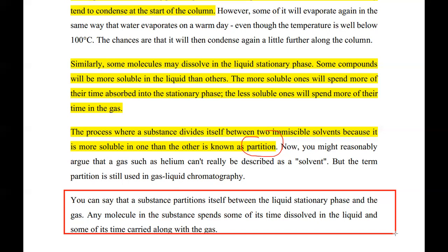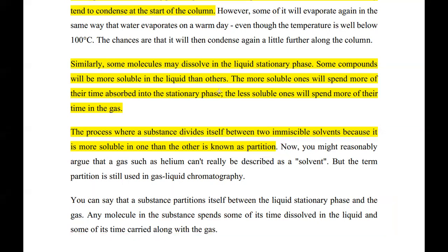There's one which is a stationary phase, then the other one is a mobile phase. Yeah, that's one way in which that can happen. You have a mobile phase, which is a gas, as well as the stationary phase, which is a liquid. So we're also likely to have such challenges whereby this substance can dissolve partly in a liquid and less in a gas, or more in a gas and less in the liquid. That's the coefficient, that's the partitioning they are talking about.